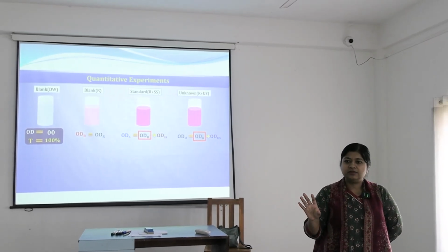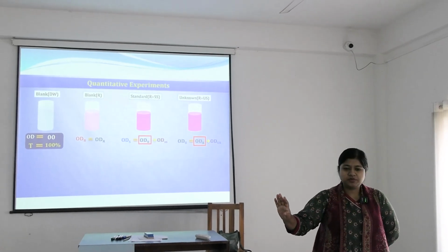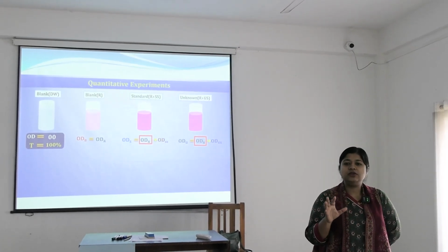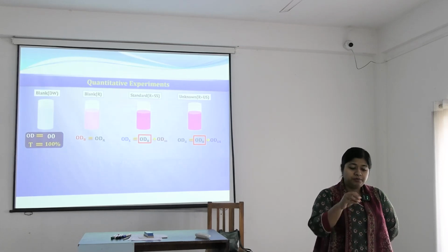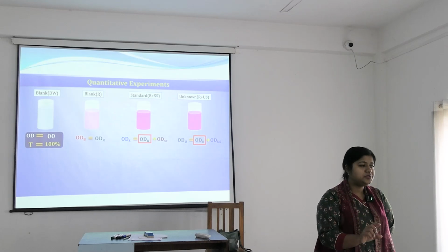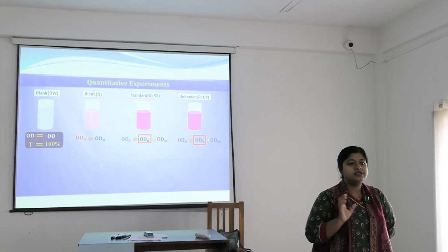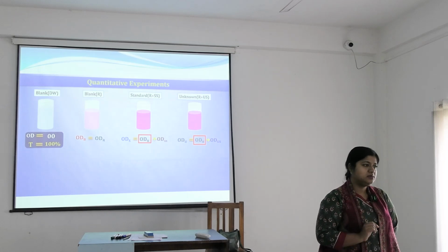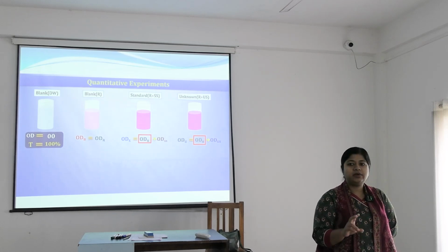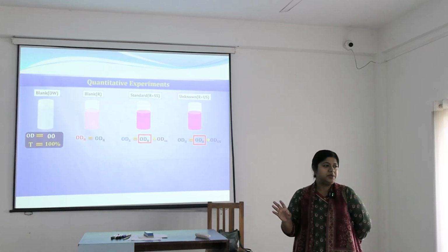100% should be transmitted. Distilled water is transparent, clear, 100% should be transmitted. So the optical density value should be 0. Okay? So by placing distilled water in a test tube, we calibrate the machine to its optical density 0. Whatever OD it is giving, we calibrate it as 0, because ideally distilled water's OD is 0, because it should transmit the 100% light.